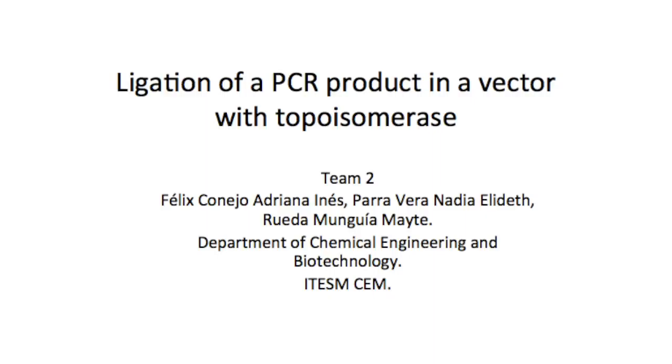One cloning system is TA cloning, which uses topoisomerase and does not require restriction enzymes. The procedure exploits the terminal transferase activity of a certain thermophilic DNA polymerase, including Thermus aquaticus or Taq polymerase. But in this protocol, topoisomerase 1 of the smallpox vaccine virus is used.